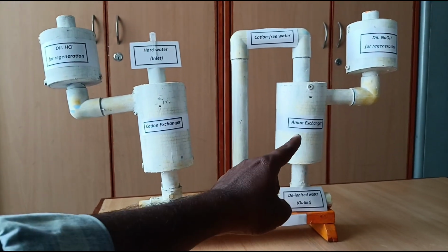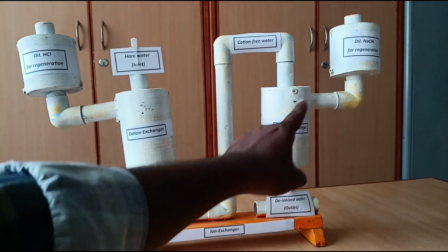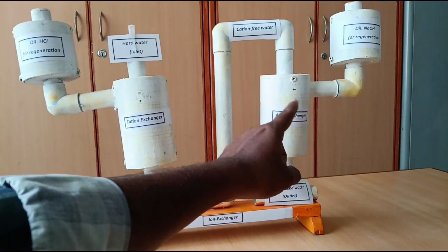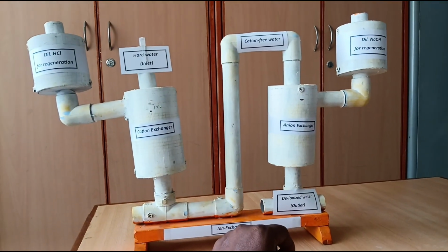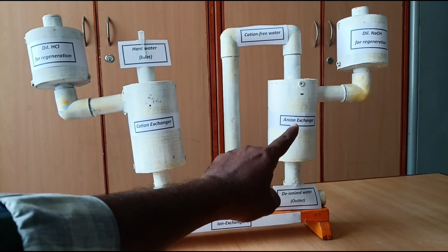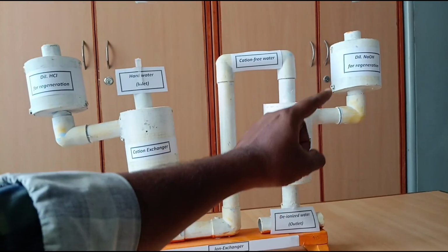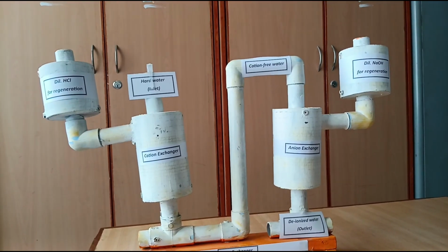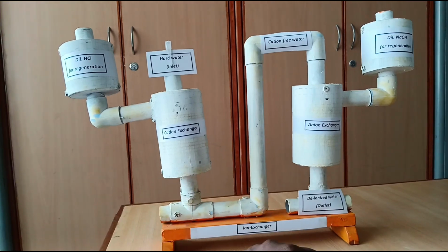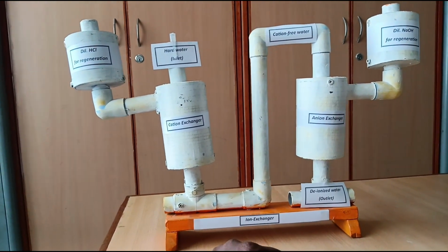Similarly, the exhausted anion exchange resin can be regenerated by adding dilute NaOH. When we pass dilute NaOH through this anion exchanger column, all the anions which were absorbed by anion exchange resin are replaced by OH- ions which are present in NaOH solution. So we can get cation exchange resin and anion exchange resin back by doing this regeneration process.